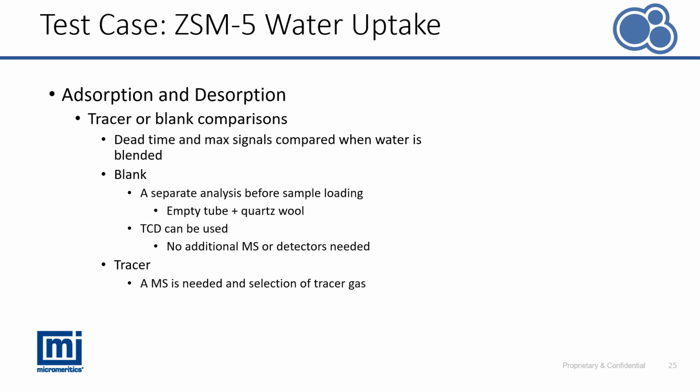Quantifying adsorption or desorption is a bit more challenging. The desorption for calcium oxalate was simpler. Water removal occurs at a higher temperature due to the monohydrate, so a baseline can be established and the onset of desorption can be easily distinguished. For uptake with adsorption and desorption, the time for the active gas to move through the system or out of the system needs to be considered. This is because as soon as the composition of the mixture changes, there is a dead time that is dependent on the properties of the probe, as well as the influences due to the packing of the sample bed and its movement through the system.